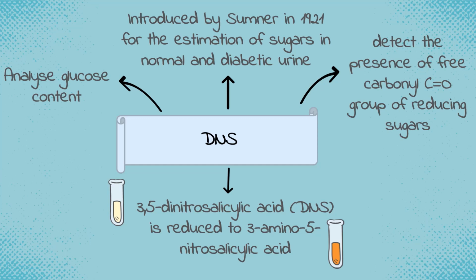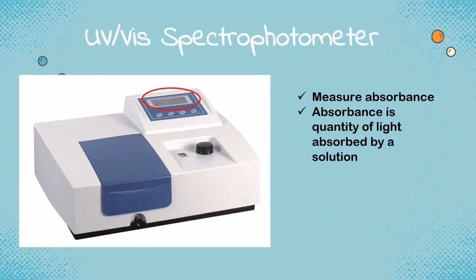The effect of DNS on glucose differs for each concentration of glucose. The level of cellulose degradation of a microbial culture can be determined by a spectrophotometric analytical method. This method is based upon the color which forms when D-glucose reduces 3,5-dinitrosalicylic acid to 3-amino-5-nitrosalicylic acid, due to its strong absorbance at 540 nanometer.